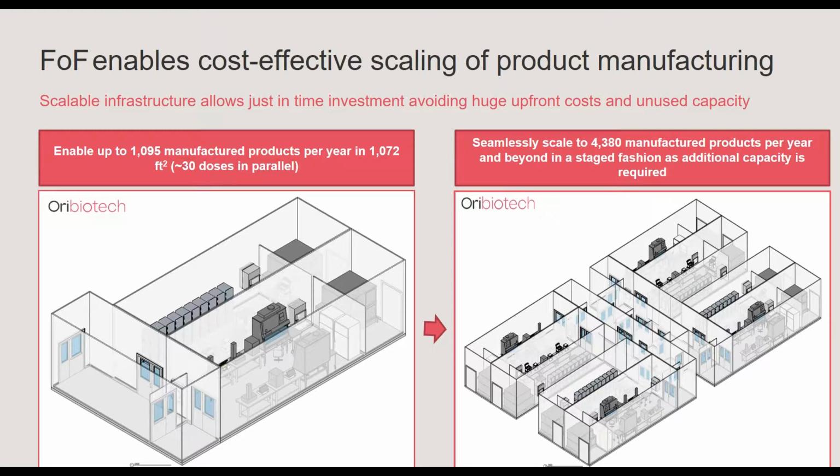We've still got Class B, we've still got hoods, there's still tremendous needs around all of that, in terms of how do we close some of the cytokine delivery, how do we close a system around the viral addition or your RNA addition or something. But still within the constraints of that, and not solving everything, we can still intensify manufacturing hugely. And then there's a vision to take this even further, go to a completely closed system, knock down that wall.